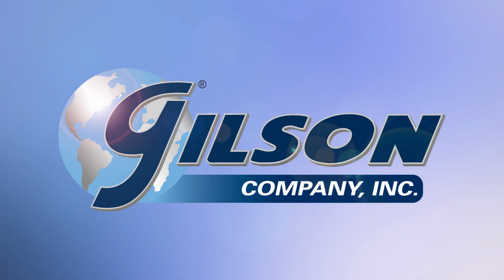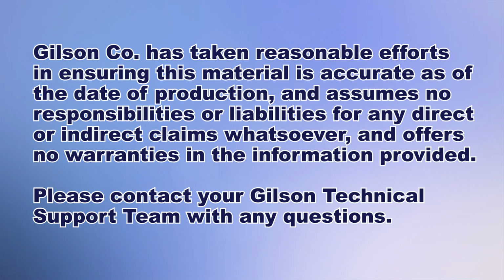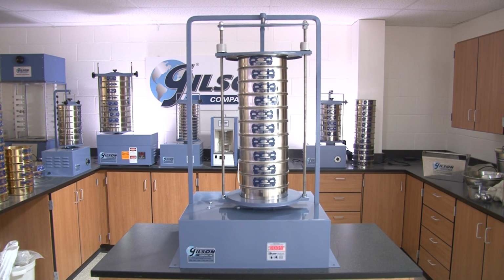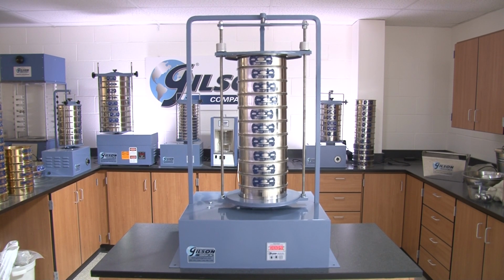Particle size analysis by sieving is a method of separating and classifying granular material that dates back to ancient times. Today, sieve analysis, used by material scientists and engineers, determines particle size distribution for many materials to accurately meet quality control requirements.